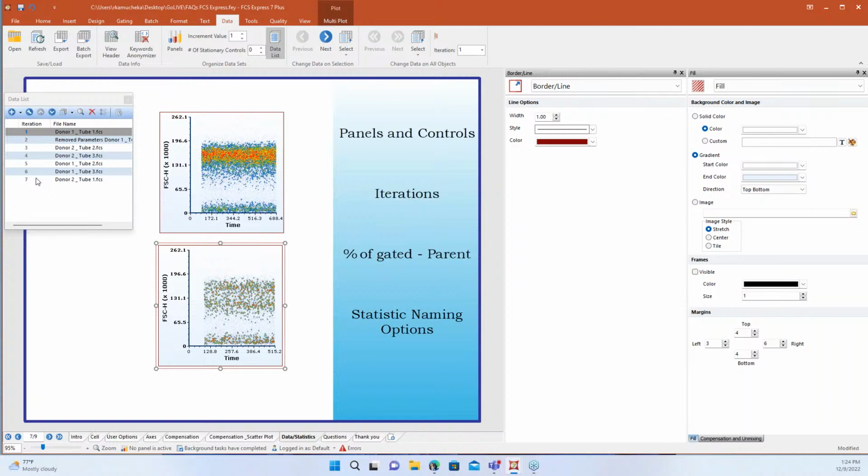So we do have a lot of options to help you manage your data. This is important because we want to optimize the use of batch processing to get those reportables out. We want to be able to move through our data in an expected way to get the most out of using the software, right? So panels and controls are super awesome. We've done a great job with implementing stationary controls. There is an option on the data tab where you can tell the software, hey, I want to use different increments or set stationary controls here.